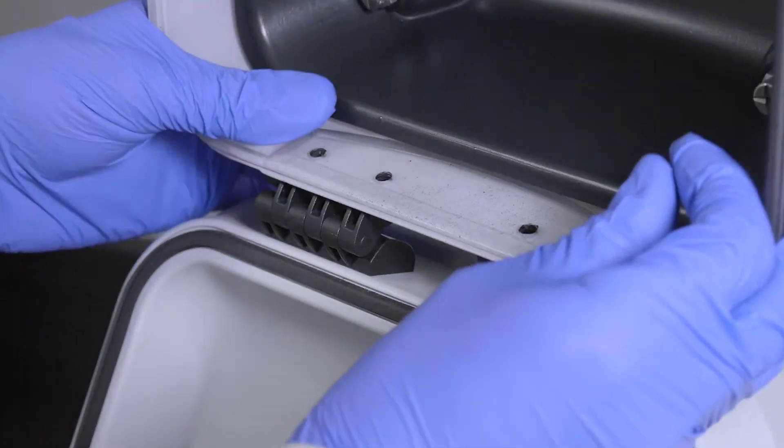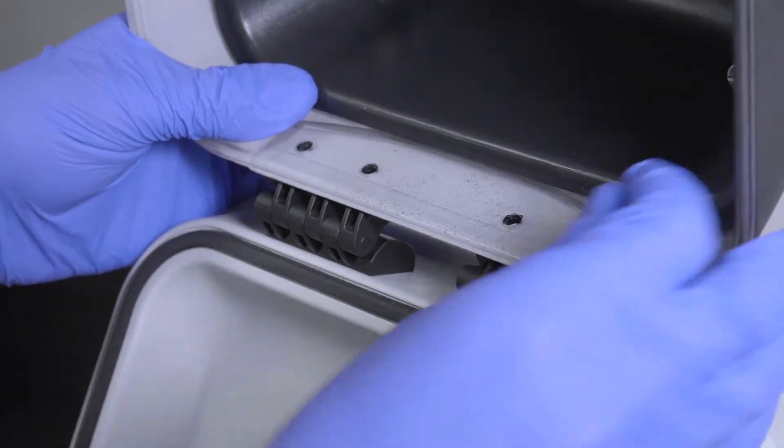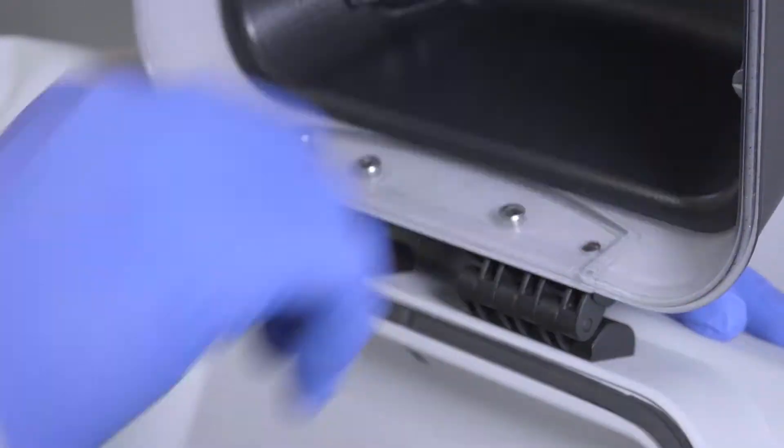Align the black cryolid onto the BeadRuptor and replace the four screws using the Allen key, ensuring that the lid is firmly secured.